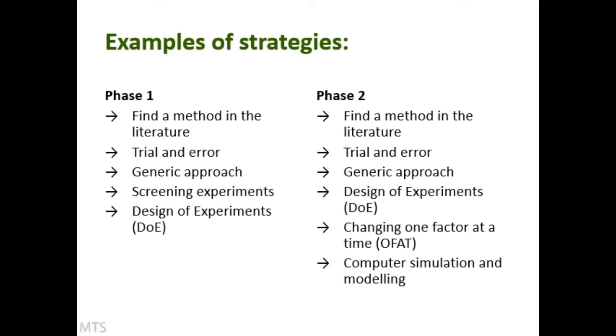Or you might want to just do a simulation. You can model your separation. There's software that can do that for you. So you would put all the data that you collect into a piece of software and it would create an in silico model. And that's very much an optimization tool. It won't tell you which column or which mobile phase to use. So I've just split them up a little bit for you. So what we'll do is go through these strategies.